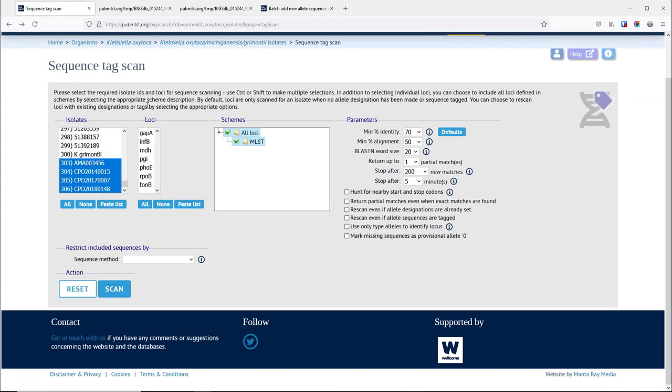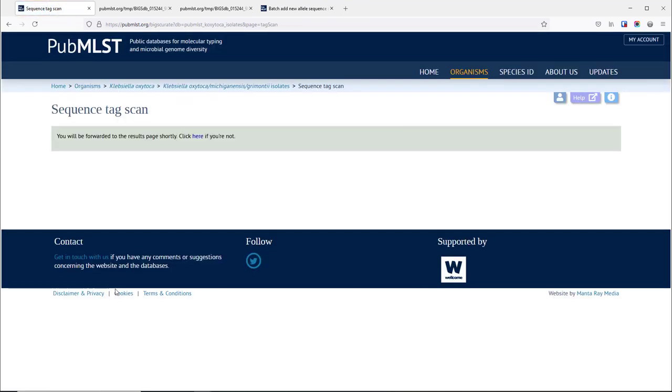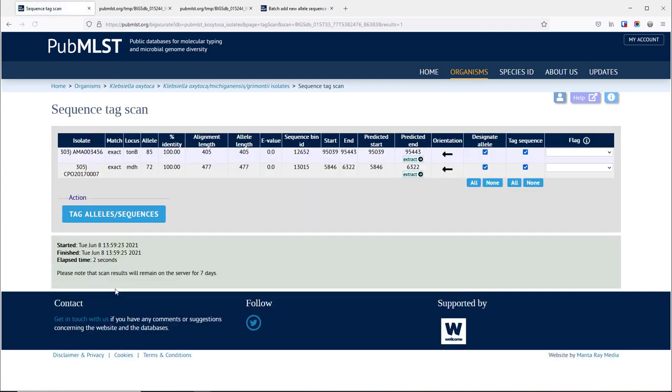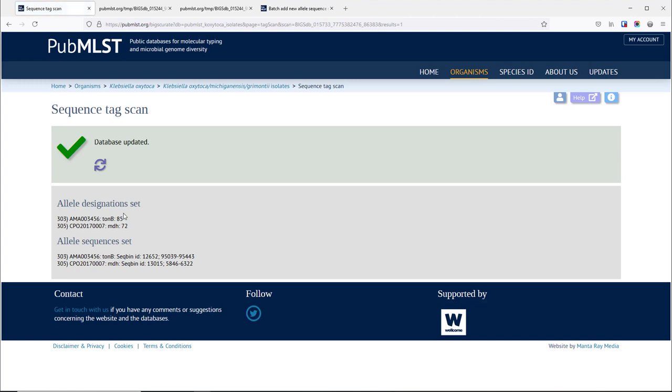Those new alleles have been assigned and then you can go back and re-scan the genomes. This time it will find the newly assigned alleles and you'll find that these are exactly matching and we can tag those and they will get marked within the genomes.